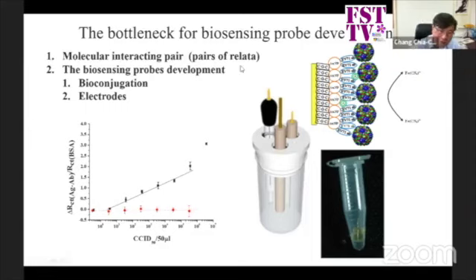So what can we do? Especially for EV, the enterovirus, currently there is only an EV71 antibody. However, if other enteroviruses, not EV71, are variants, we may not detect them. So that becomes another problem.